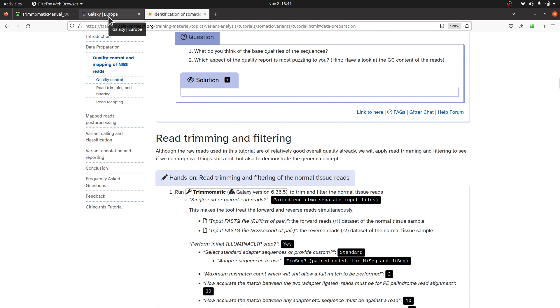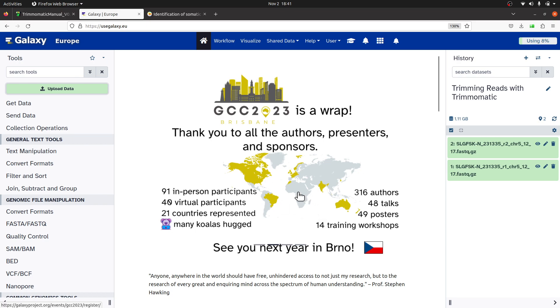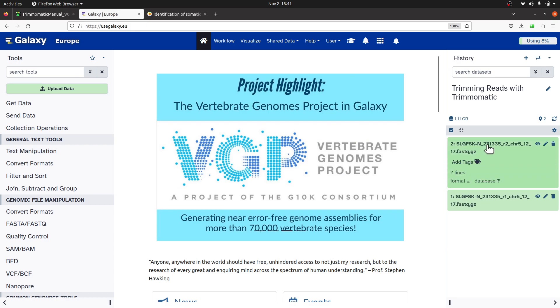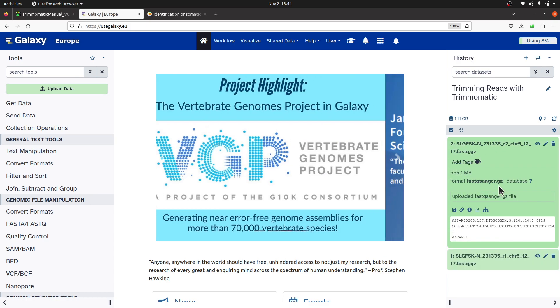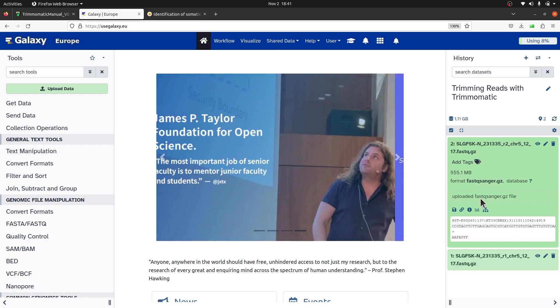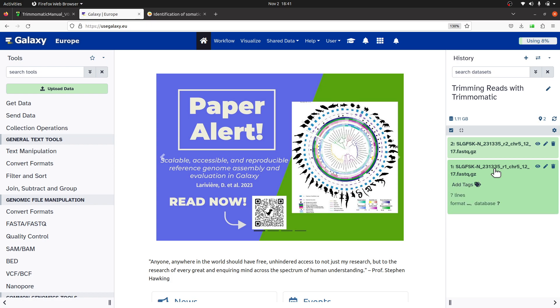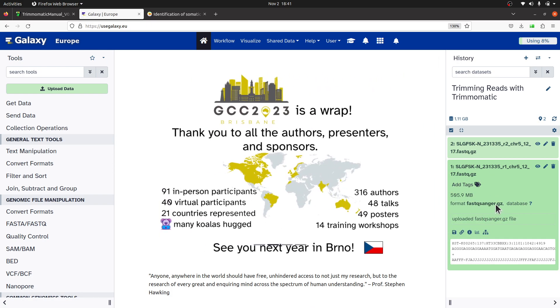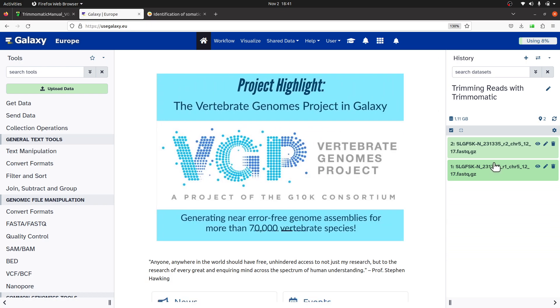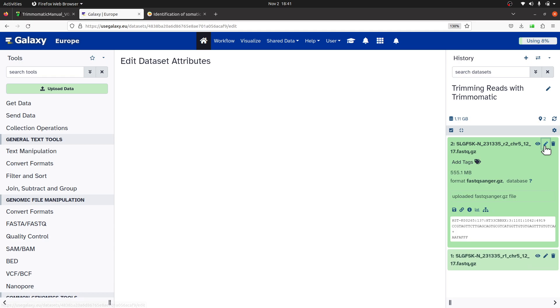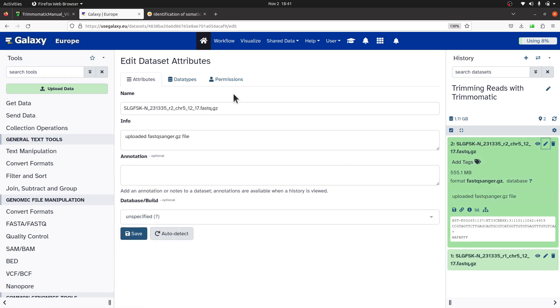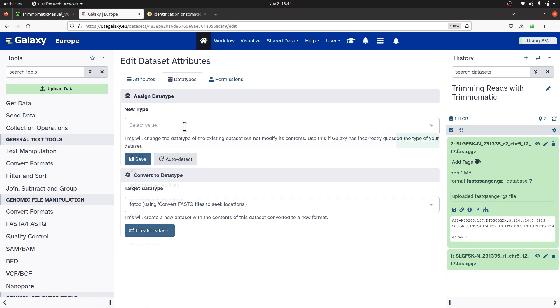Before we proceed to trimming, let's do one last check. Click on both files and make sure that the format is fastqsanger.gz — it's important. Check the other one too — fastqsanger.gz. If you don't see that format, go to Data Types and select fastqsanger.gz to correct it. For me everything already looks fine, so I don't need to make any modification.